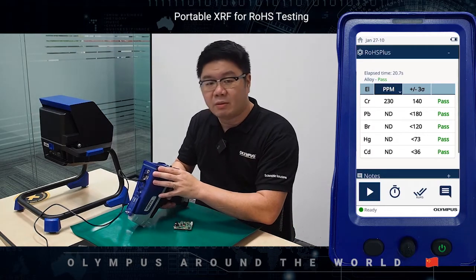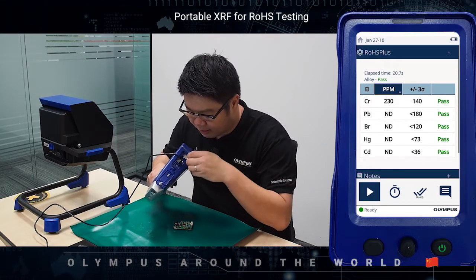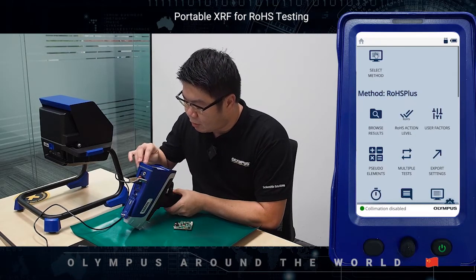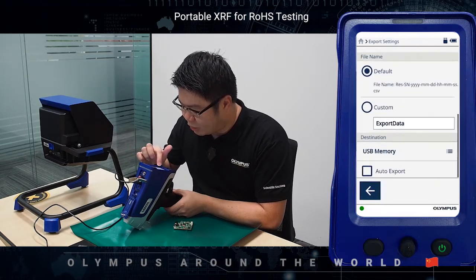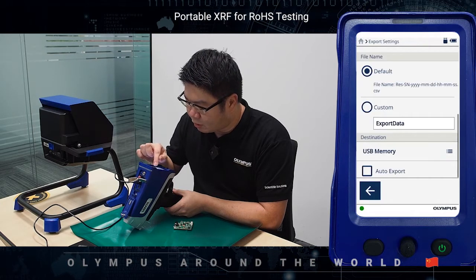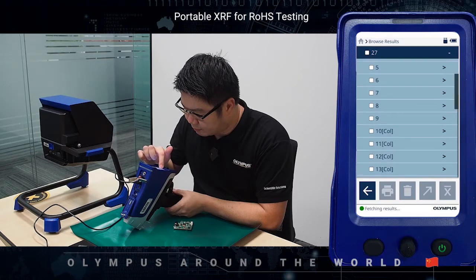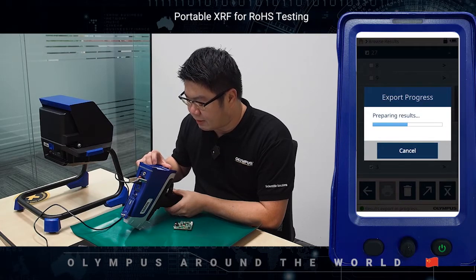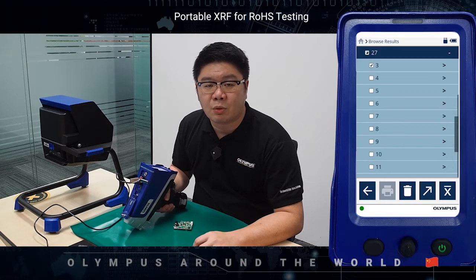Once the result has been completed, all you need to do is take a USB flash drive, put it into the USB port in the Vanta, go to the export setting, under destination make sure USB memory is chosen, then go back, go to browse results, select the results that you would like to export, then simply tap on the export button to export the data into the USB flash drive. With this feature, you will no longer need to connect the Vanta to a computer anymore.